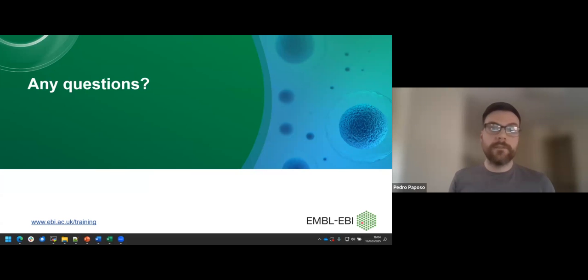I don't think we have that. So in that case, if you want to search a specific region of the protein, you are able to download the FASTA of the protein, select the region, and then BLAST it against our website. I would recommend that.